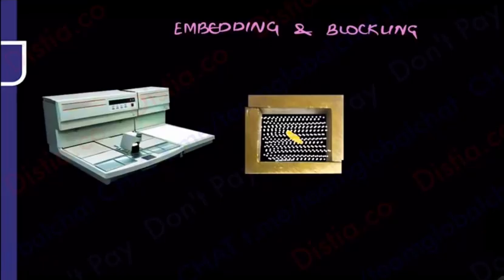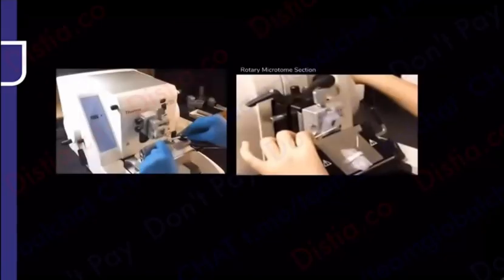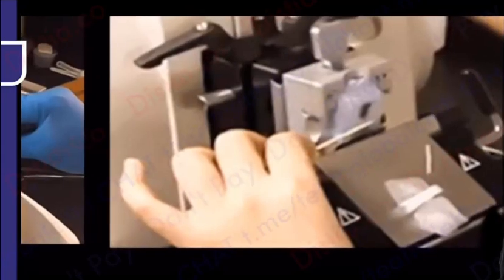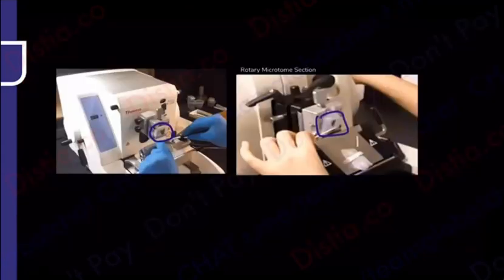So this is the machine that is shown to you. This is how embedding is done. And look, finally, this is exactly how your tissue is going to look. Can you see there's a waxy tissue over here? Can you see your skin biopsy is inside wax? Look at this over here. Skin biopsy is inside wax. So you've got something called a block.